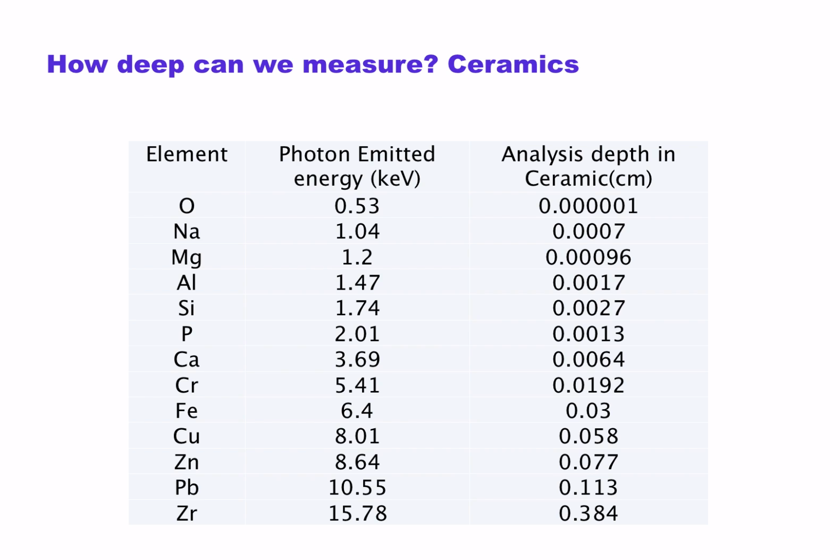This is pretty important in understanding how to handle variation. A lot of your samples may have different variation. So if you want to measure zirconium reliably, your sample is going to be at least as thick as you're seeing zirconium in the sample. Any thinner, and some of the variation in zirconium you get is going to be driven by the thickness of your sample, not the actual concentration. Remember, X-ray fluorescence is measuring atoms, not weight percent, not parts per million, purely atoms. The thicker the sample, the more atoms. The deeper the sample, the more of those atoms you happen to measure.